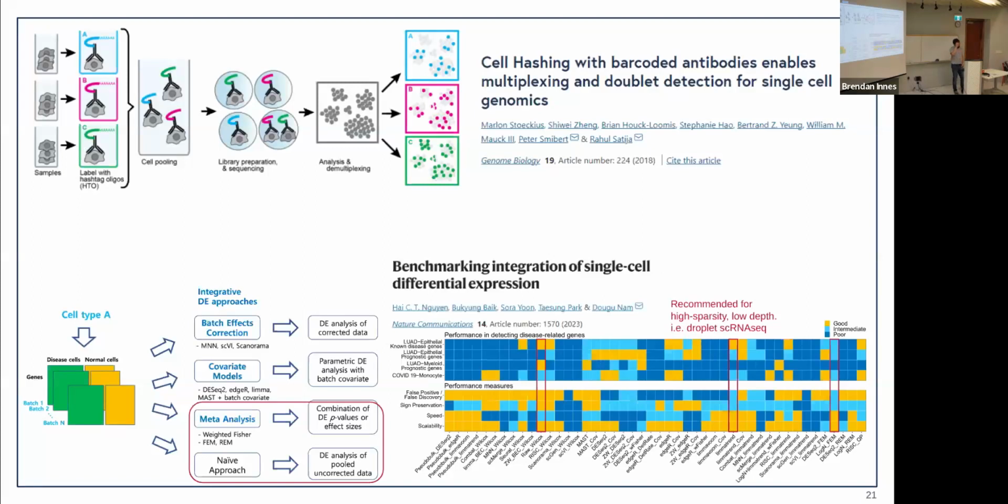And to come back on that point where you're talking about double dipping and inflated p-values, if you just set a cutoff and you get 0.04 or 0.00001, you just count it as significant, or you ignore the p-values. That's also a strategy. You focus on log fold change.